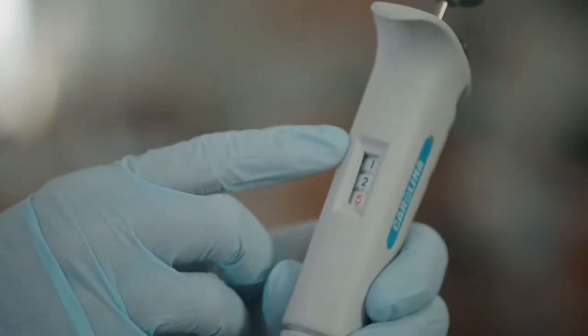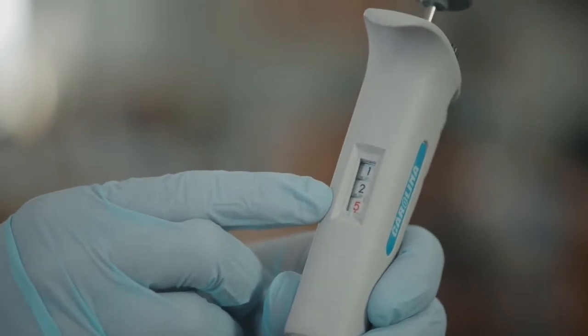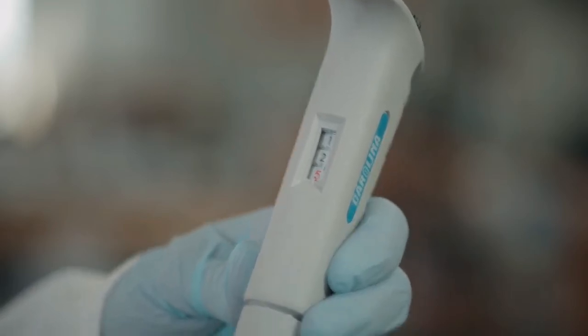For this P20, the top digit represents the tens place. The next digit down represents the ones place. The digit on the bottom in red represents tenths. This micropipette is set to take up 12.5 microliters.